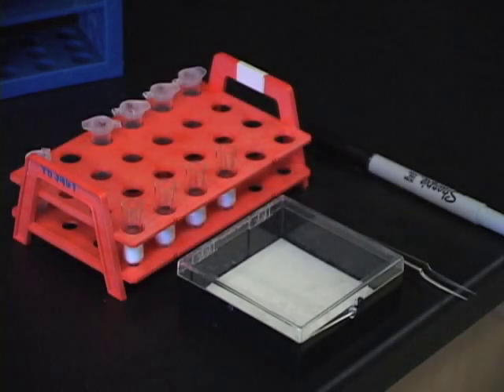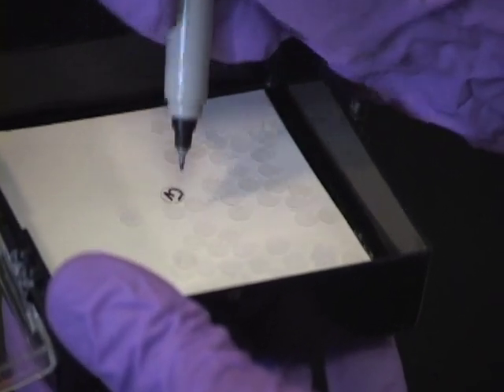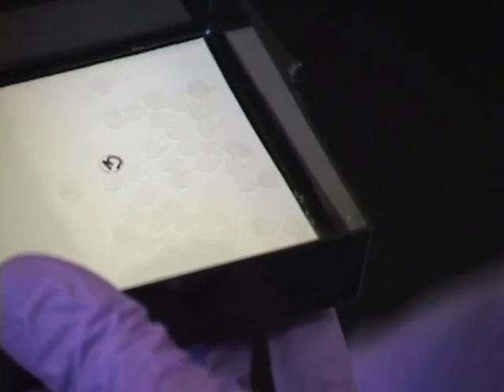Using a Sharpie, draw the number 3 on a polylysine coated coverslip. Coverslips are from Belco Glass. We coat them with polylysine ourselves and do not use commercially coated coverslips.